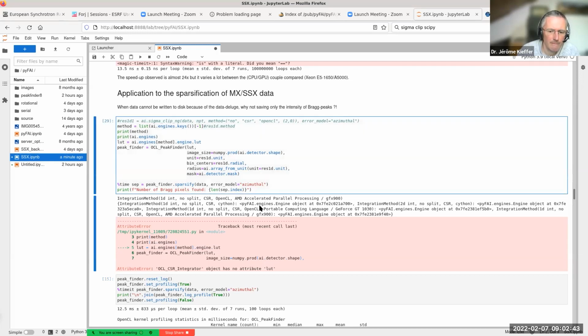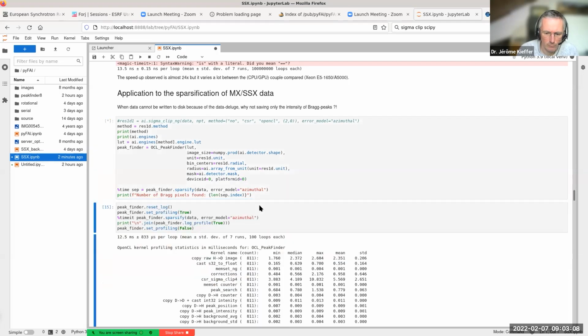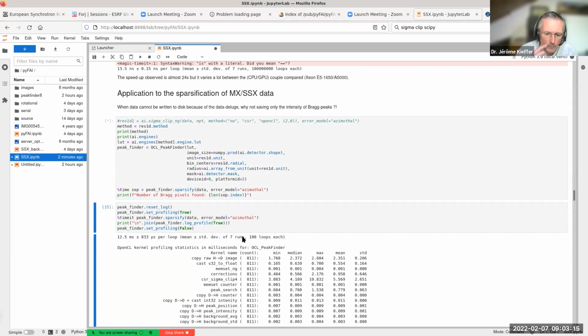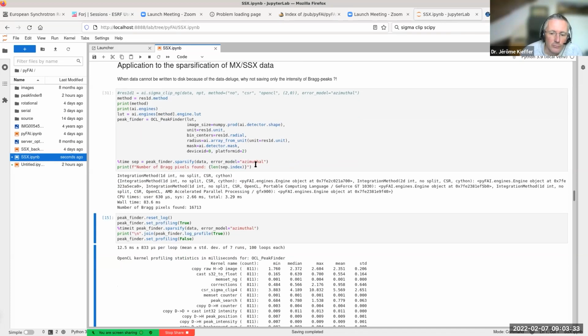Hmm. Sorry, the bug is here. Well, no, it doesn't run faster. Okay, but forget about this.